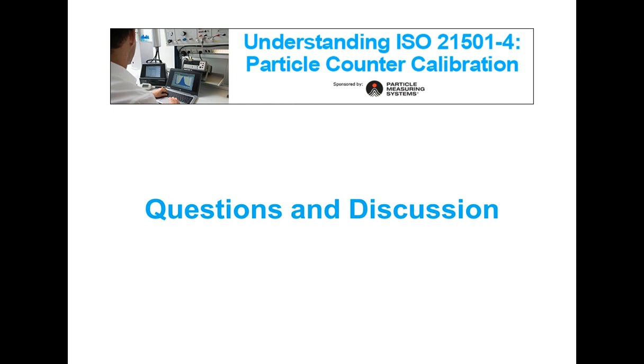So particle counters are normally calibrated with NIST traceable standards, and also Particle Measuring Systems offers 17025 calibration with traceable standards, and any service provider should also be able to trace the loop of measurement from the standard for all the standards used.